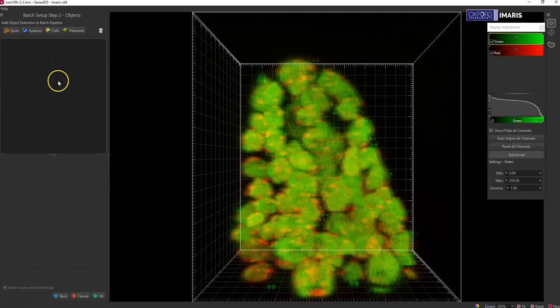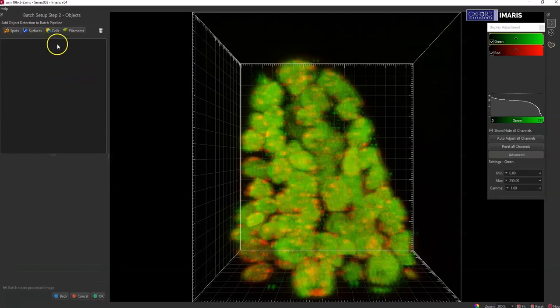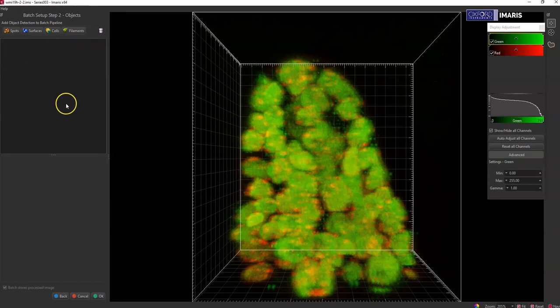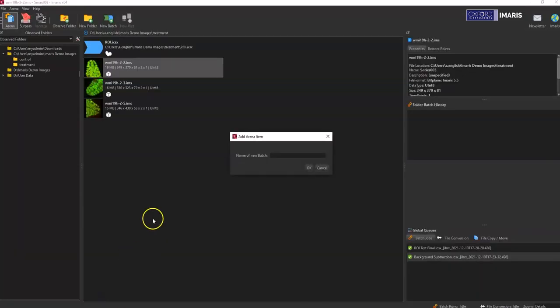And then if you needed to do any other types of object detection that are separate from your ROI, you could do those here. You don't have to do anything here, so you just hit OK if you wanted to skip that.